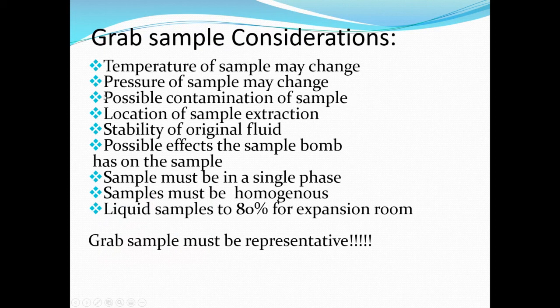So whether the cylinder was clean when you started, or whether Cletus, the operator, did the proper procedure to get a sample, that could be a problem. The location of the sample extraction, again, could come into play. The stability of the original fluid, the effects of the sample bomb that it might have on the sample. So again, this is reactivity between the sample that we're pulling and the bomb itself. You know, is it stainless, is it glass, is it Teflon, whatever it happens to be.